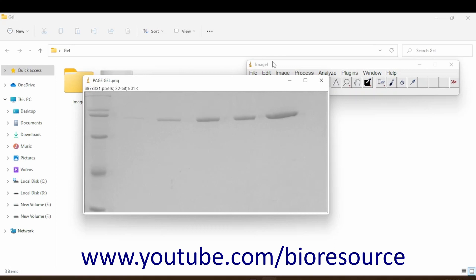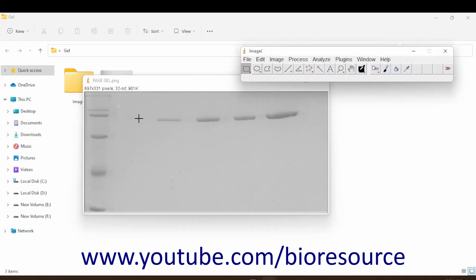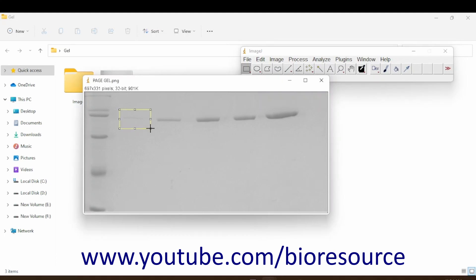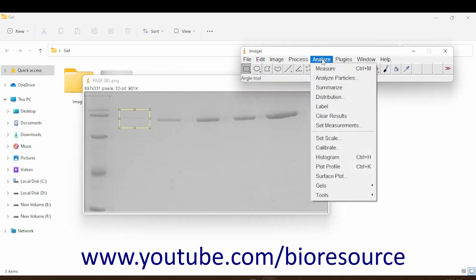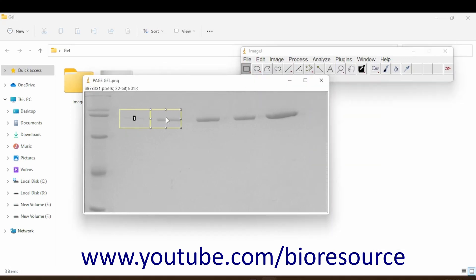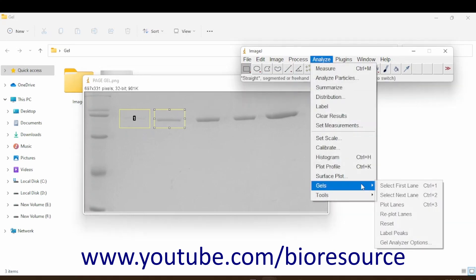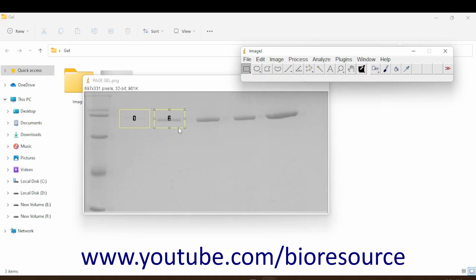I will just select and mark this. Okay, so this is our control band. Go to Analyze Gels and select it as the first lane, then move to the next well and do the same process again until you mark all the wells.